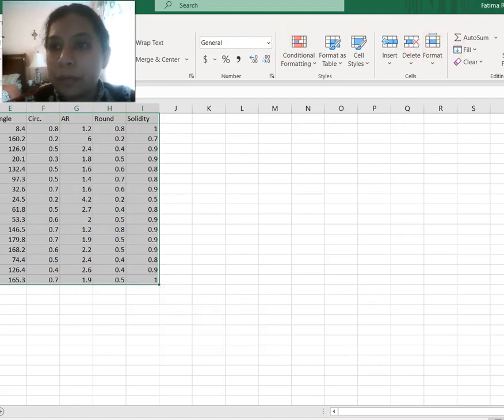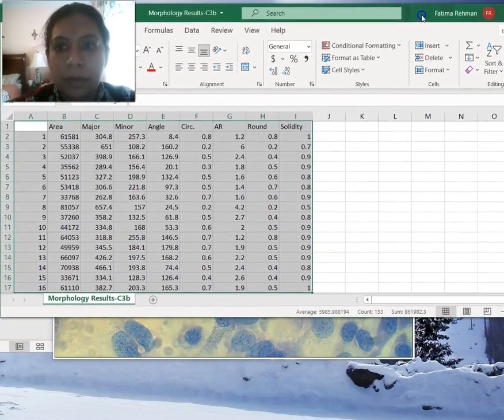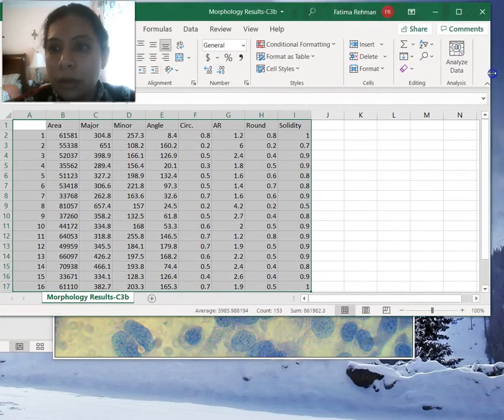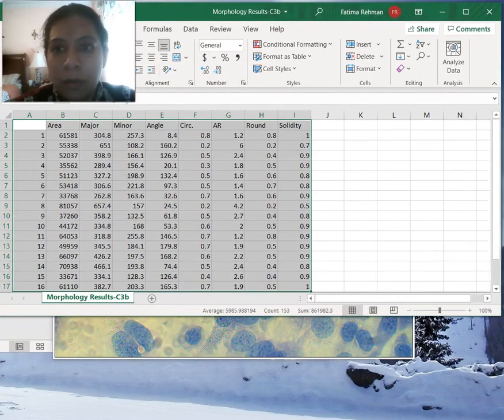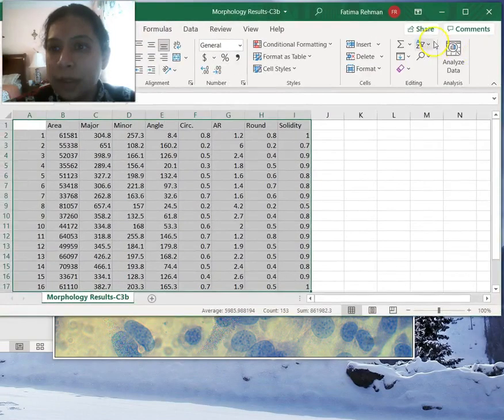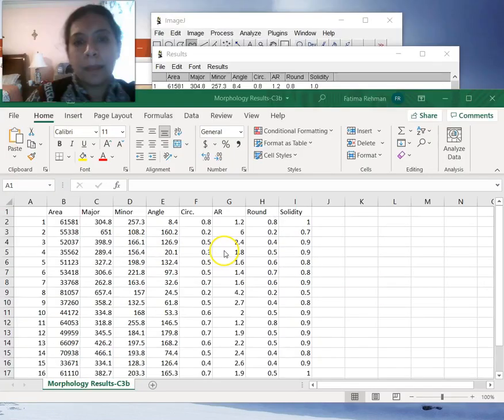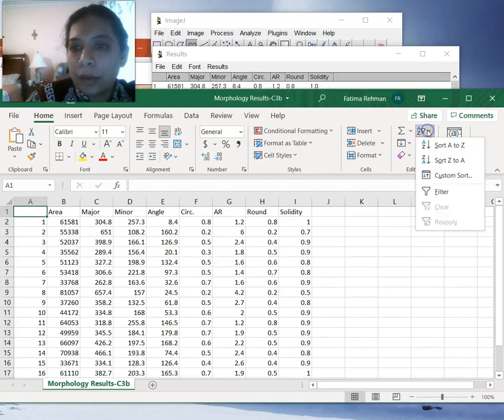So in this top bar, under home, you will find your sorts.